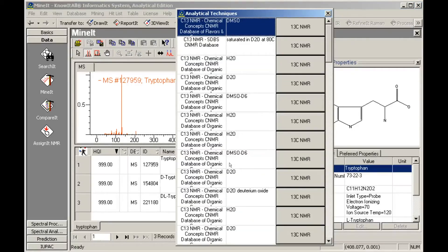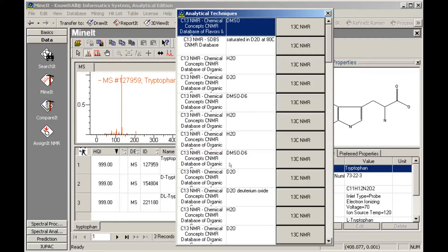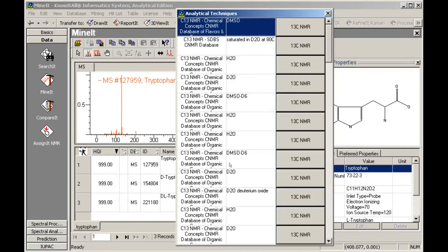This pane shows all spectra available for this structure, and includes database name, solvent or other details, and a link to the database record. Many other spectra are available for this structure.